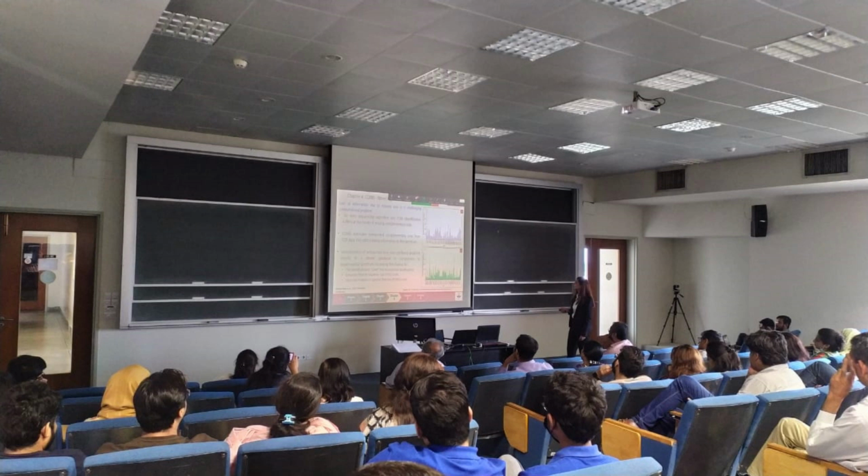Let's say I have a protein of 100 kilodaltons; that will be analyzed by top-down proteomics. With top-down proteomics, you measure the mass of the entire protein, then cleave it into two random fragments and measure their masses. So is there a limit to the mass of the protein?